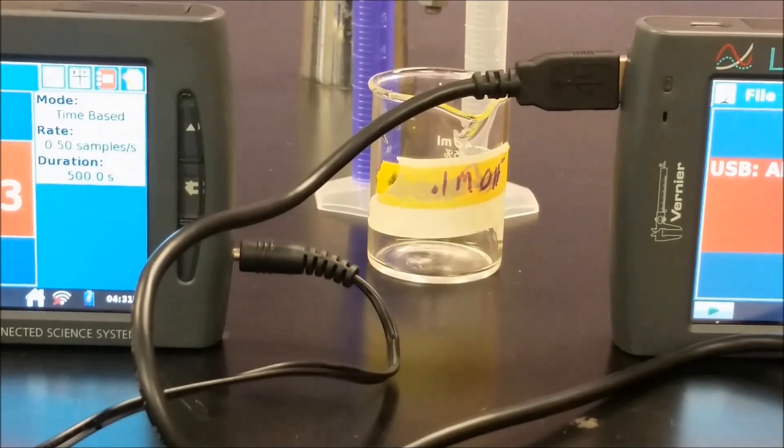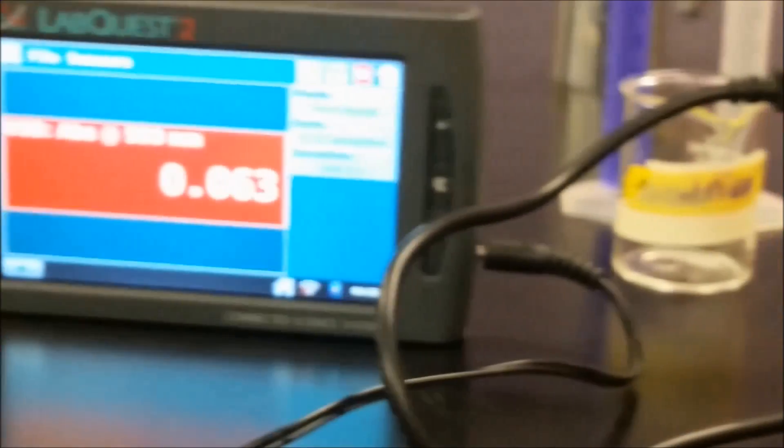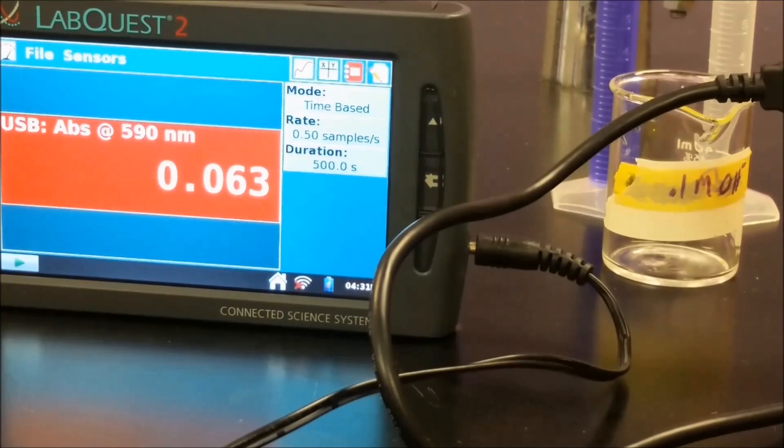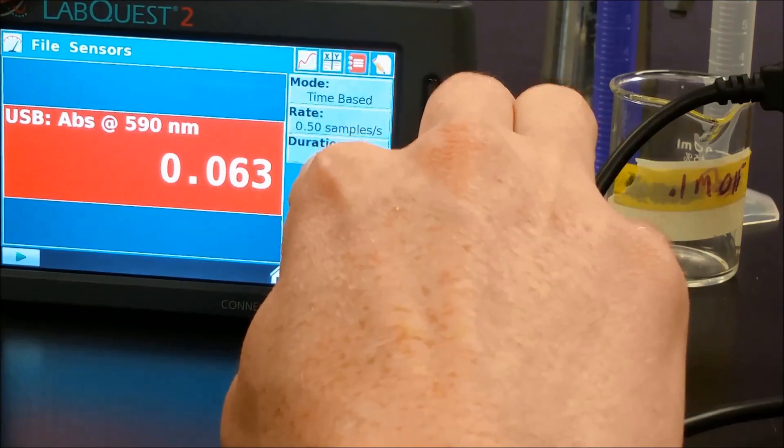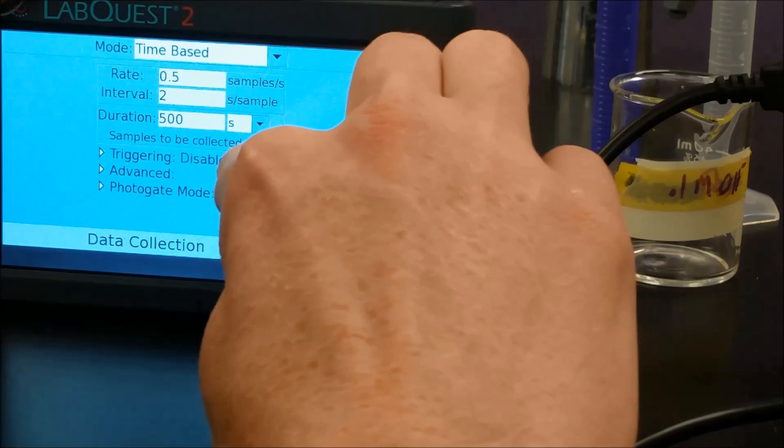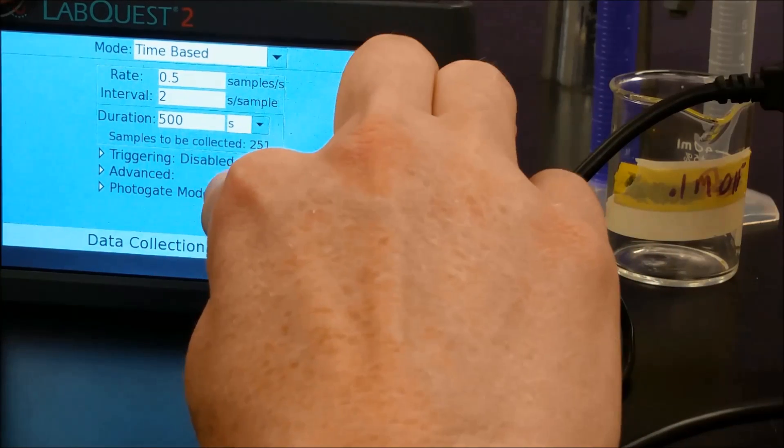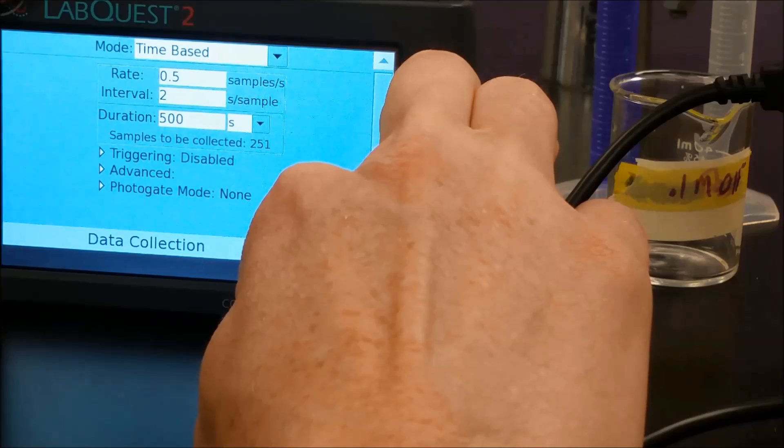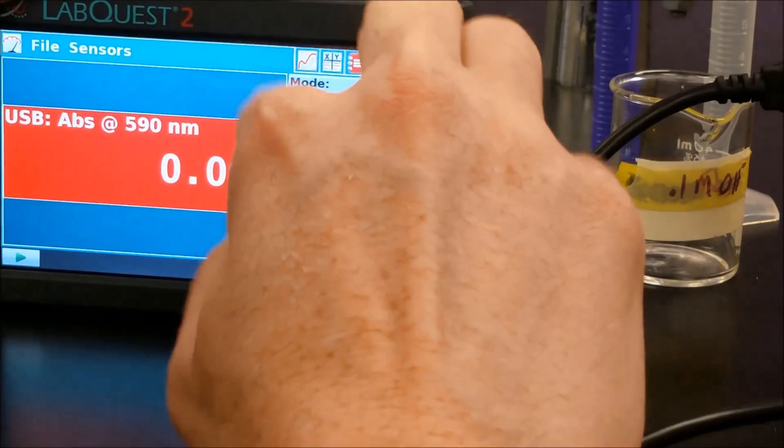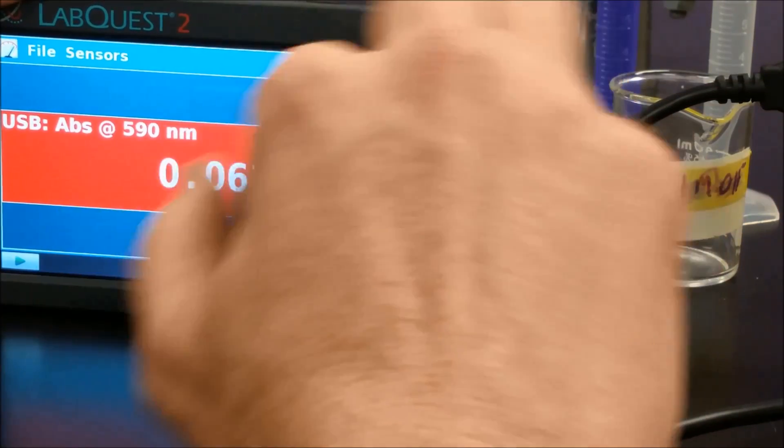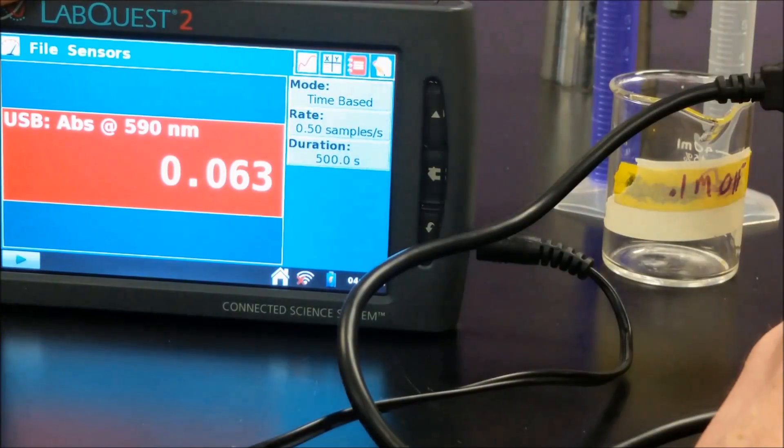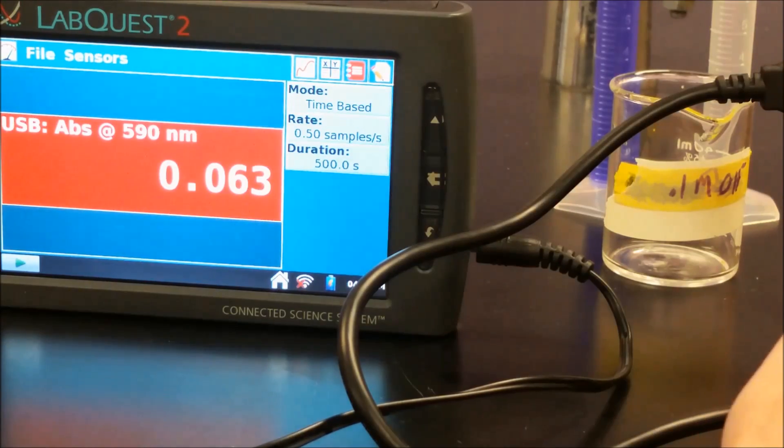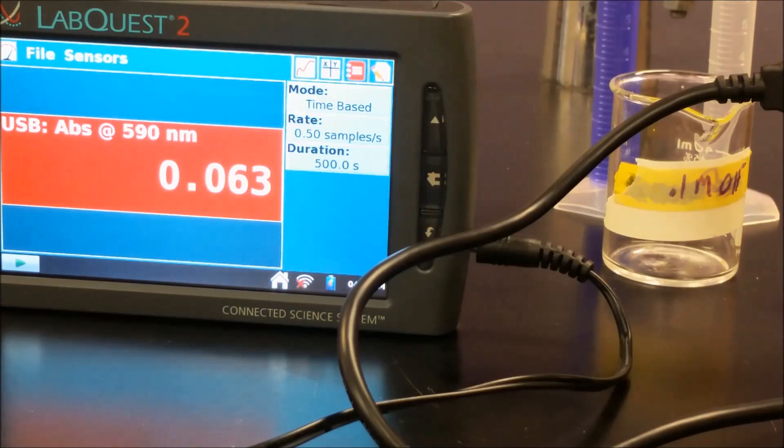Now before we do that, let's go ahead and zoom in on our vernier. So we can make sure that we're on the right setting. So for mode, you want to be under time-based. And then for the duration, you want this to go a little longer than what it usually starts off with. So it usually starts off at 200. So I'm going to change it to 500 because I have a higher concentration. But depending on your initial concentration of hydroxide, if it's lower, you might want to run this for a little bit longer. And then we've changed our wavelength to be the same for both. So they're both at 590 nanometers. And as soon as we hit play, it'll be ready to start collecting data.